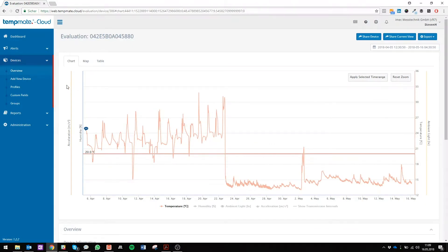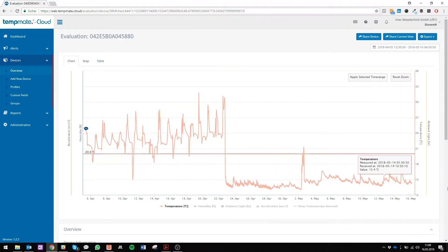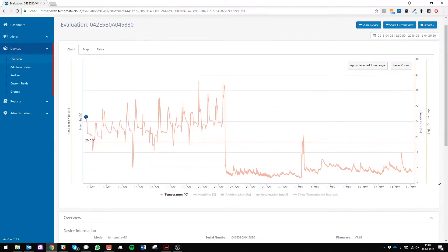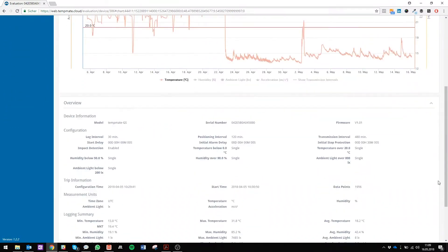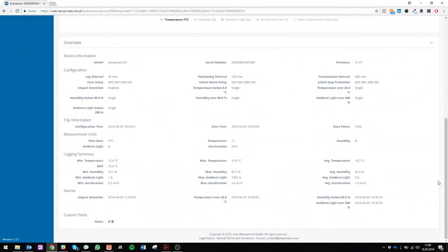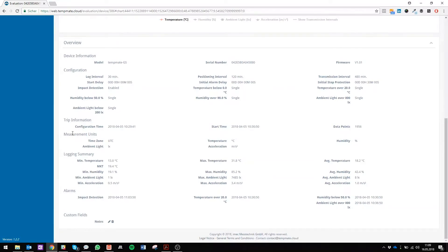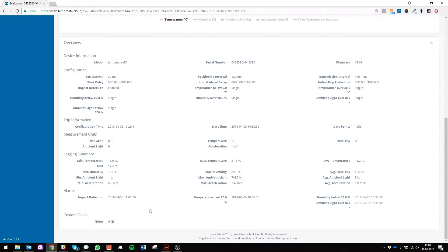Now you see here your chart, map and table view. If you scroll down you can see your device overview with your device information, configuration, trip information, measurement units, login summary, alarms, and also your custom fields.